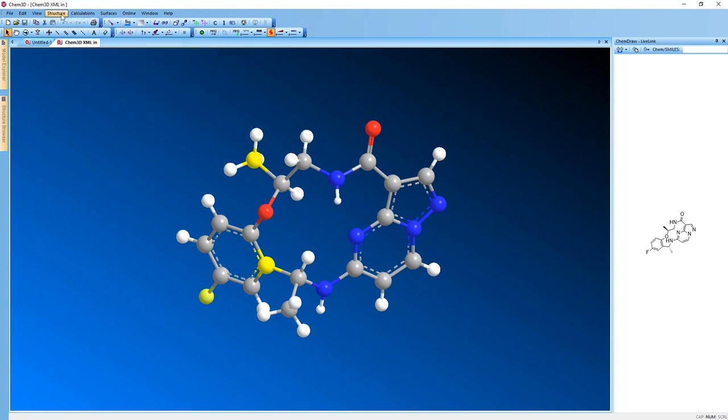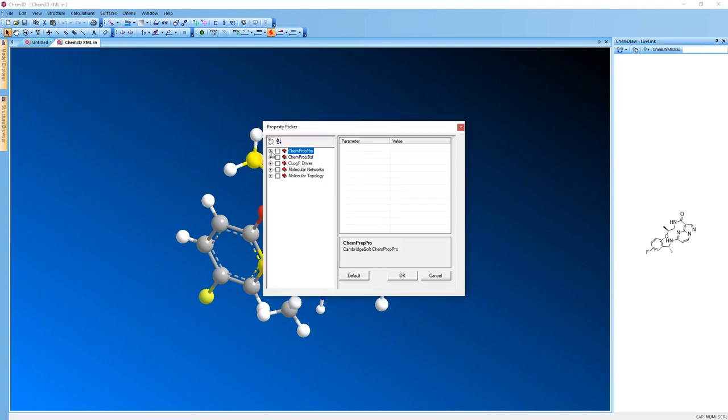And besides that, go beyond that and calculate a large set of different properties, right? These could again be things like we saw before, like log-P, etc., but they can also go way beyond that. So this is the second option that you have as part of the wider Signals ChemDraw suite of products to get to certain calculated properties to analyze your molecule further.